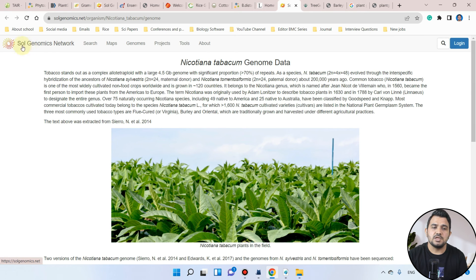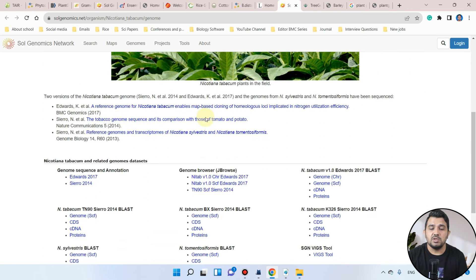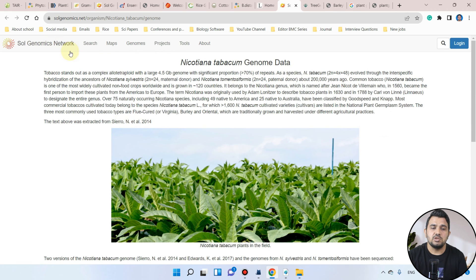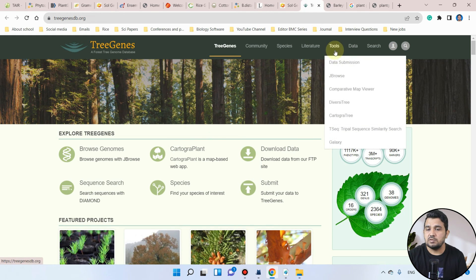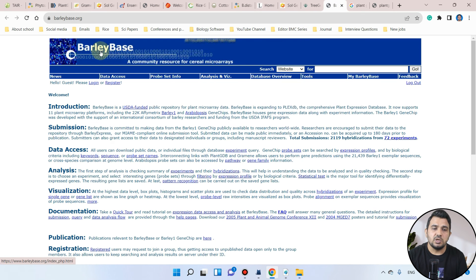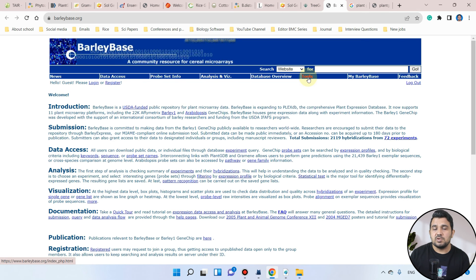The next one is the SOL Genomics Network for Nicotiana tabacum, where we will retrieve sequences for that species. If you are working on any tree species, you will be using Tree Genes and its tool functions. If you are working on barley, you can use the Barley Base and its different tools to identify protein sequences for genome-wide analysis.